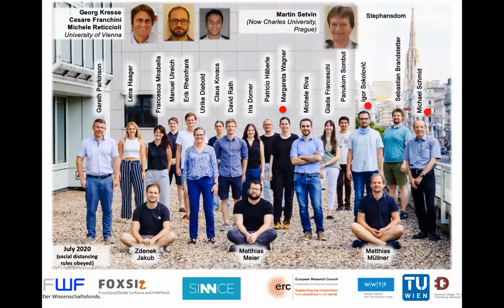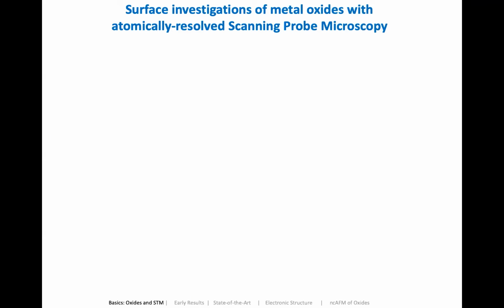All right, so this is the topic of my talk: surface investigations of metal oxide probed with atomically resolved scanning probe microscopy. Okay, so metal oxides, that means you have a metal atom, we talk atoms of course, and you have an oxide, an oxygen atom. They come together and make a metal oxide, and then because the oxygen is very electronegative, it sucks away the electron from the metal. Oxygen is always in oxides, normally, formally, twice negatively charged.